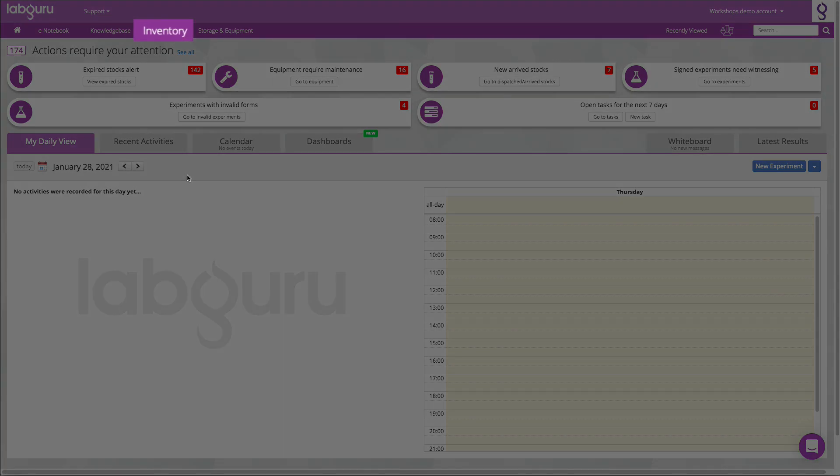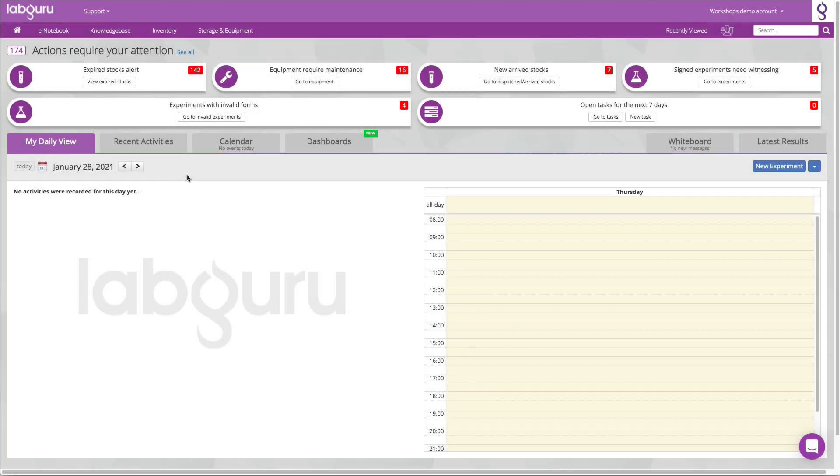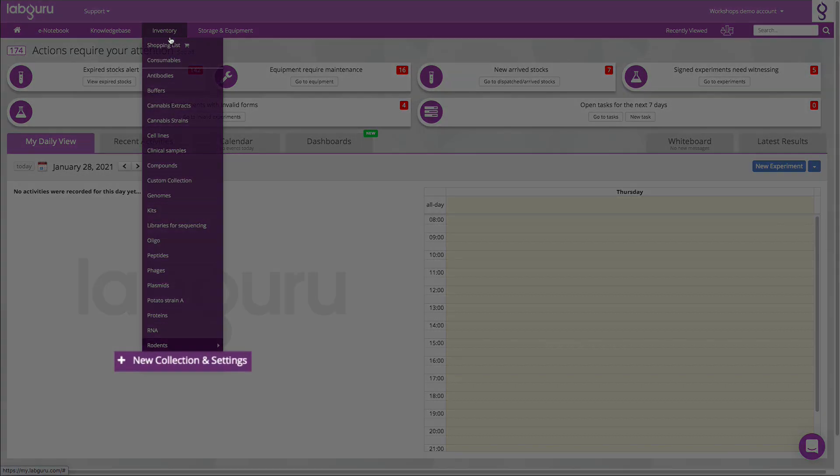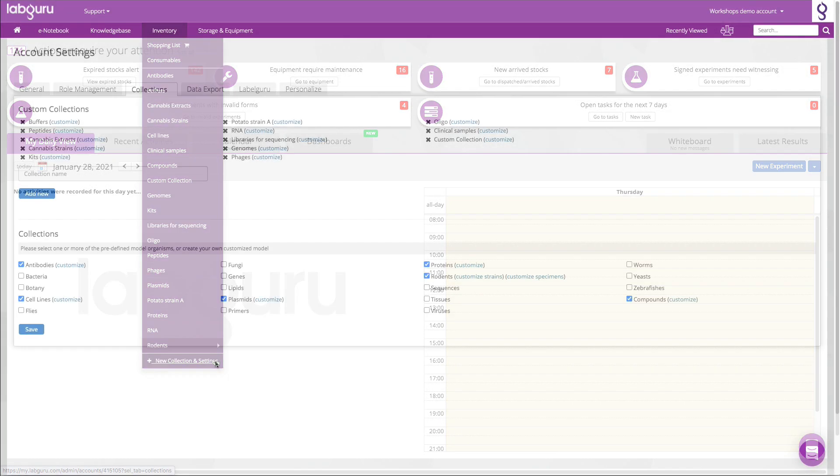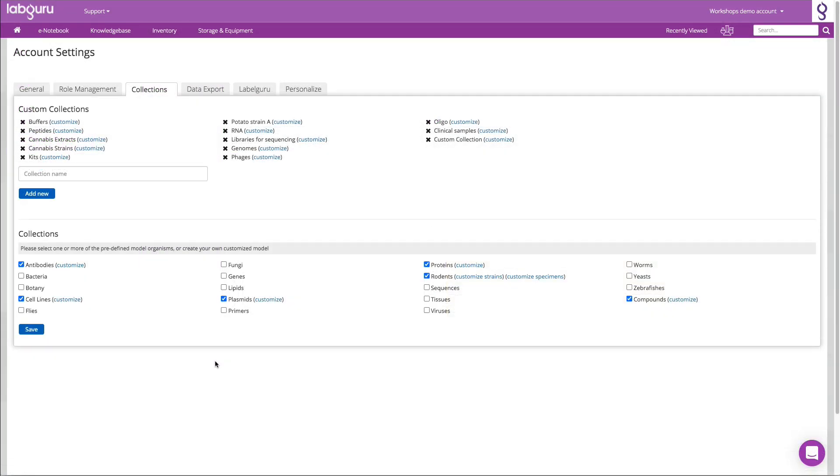The inventory module in LabGuru is the place to organize and manage your lab's collections. The first step is to define which collections you wish to manage in LabGuru.